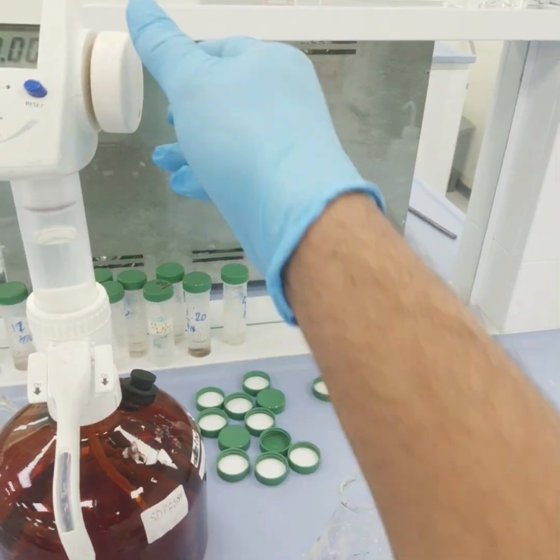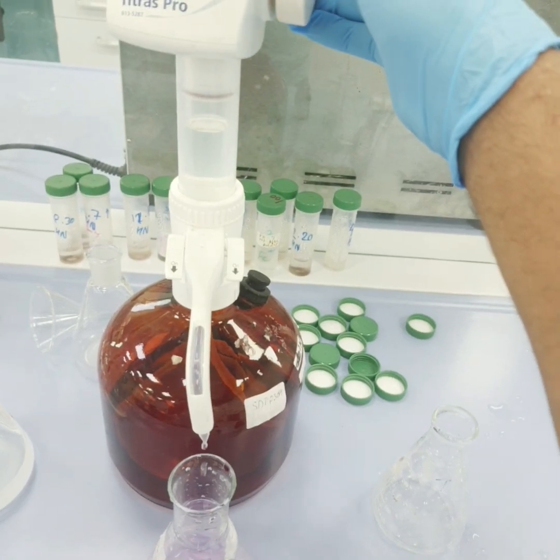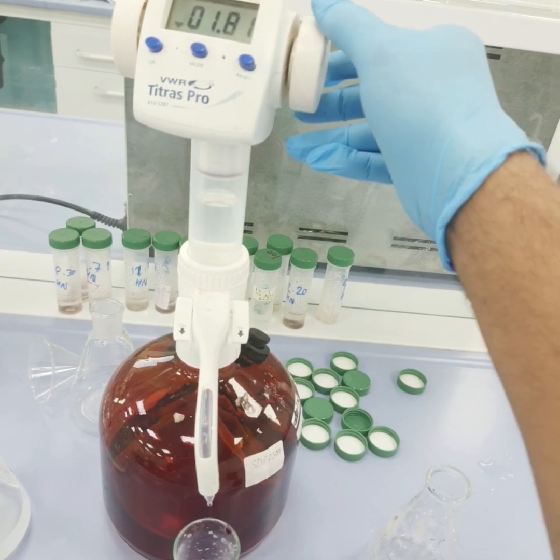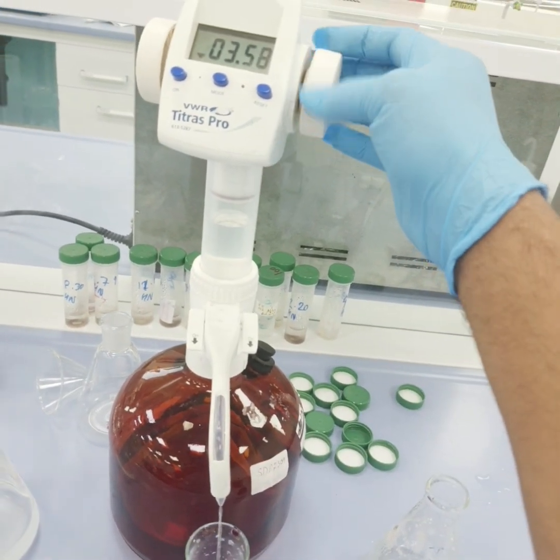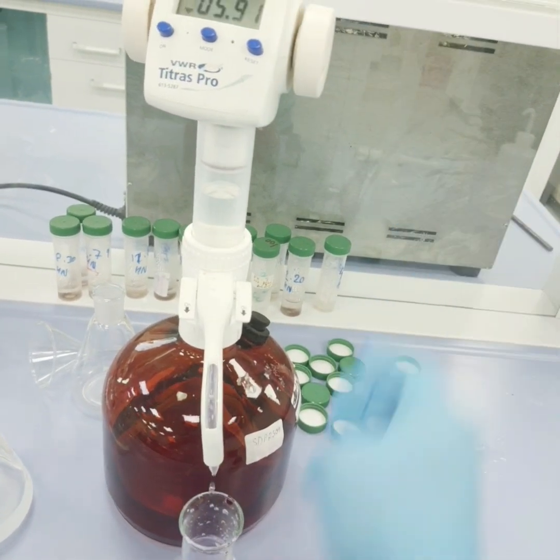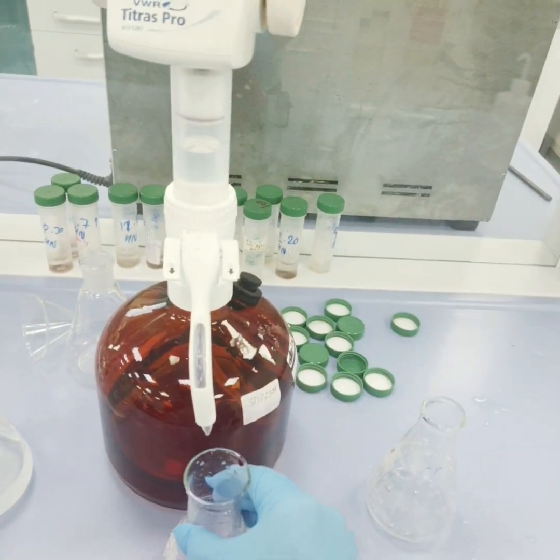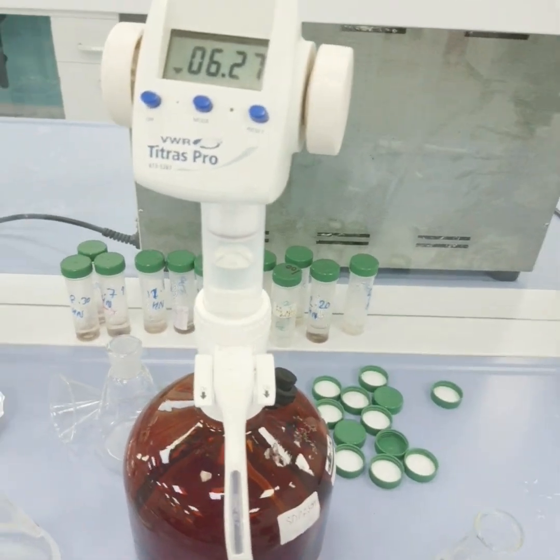Now I would add slowly till the color changes. Now you can see the color has changed. So the amount of the EDTA consumed is 6.27.